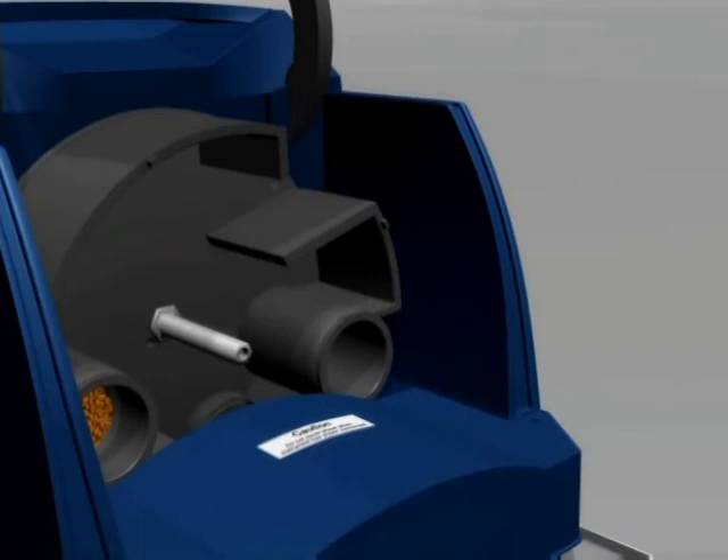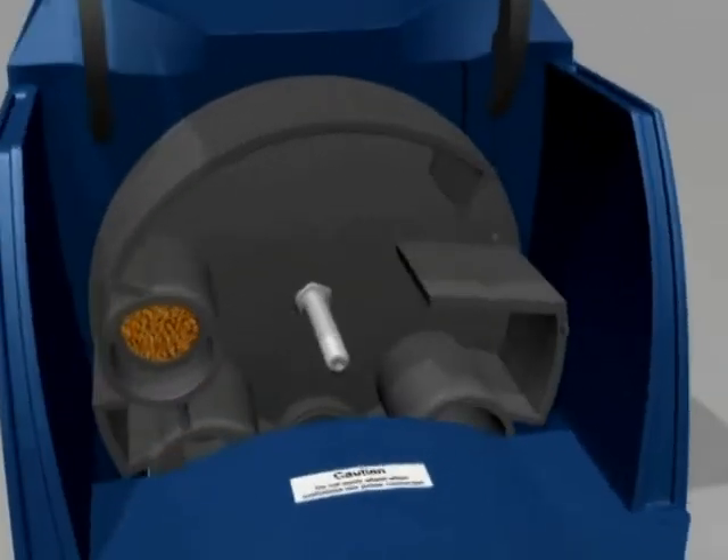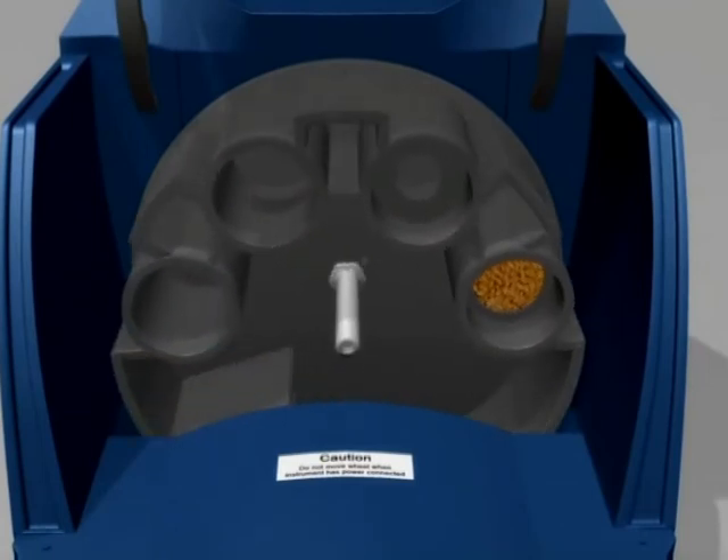Use the cleaning brush to dust away any foreign material trapped within the insides of the sample handling wheel. The sample wheel can be turned to bring the four cylinders to the top to make them accessible. The sample wheel should only be rotated manually if the unit is powered off, otherwise gearbox damage will result.